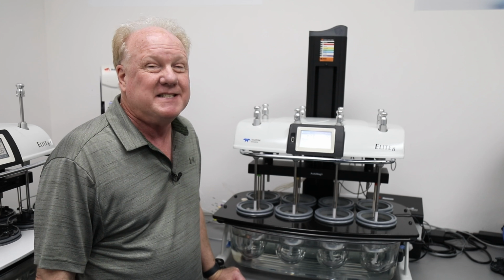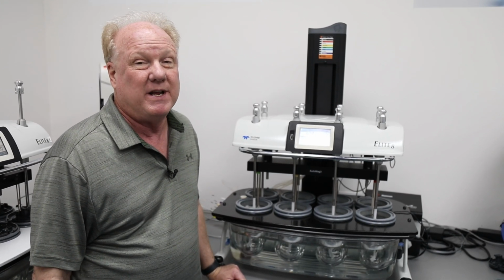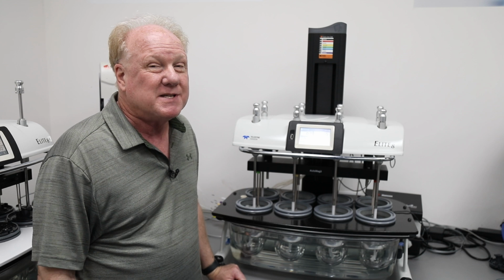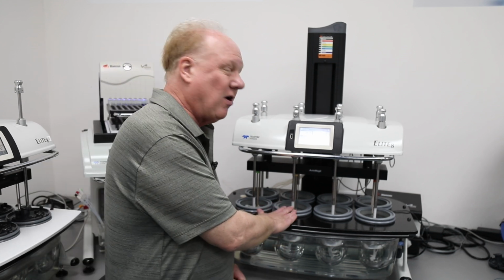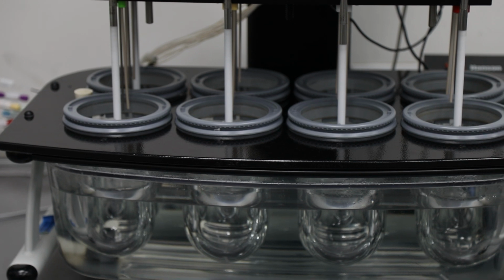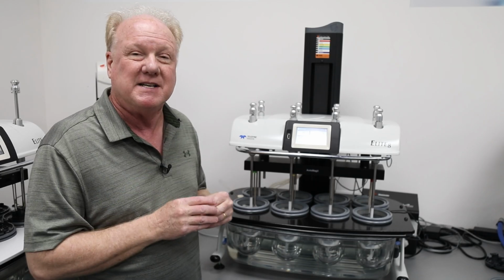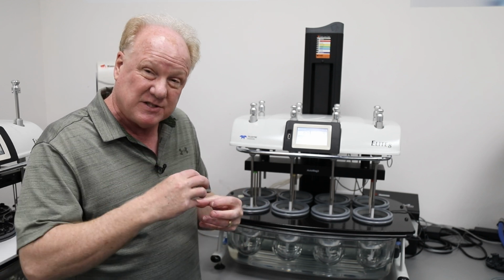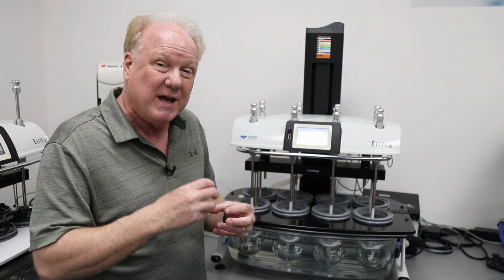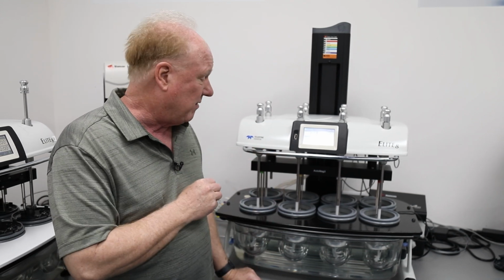Let's talk a little bit about degas in media preparation. Degassing is an important part of our media preparation step. Bubbles can be an enemy in dissolution analysis. If we introduce a dosage form into our vessel and we see that it's covered with bubbles, those bubbles can actually block or limit access of the media to our dosage form. And if the media can't get in physical contact with our dosage form, it makes it much more difficult to solubilize the active ingredients away from the sample.